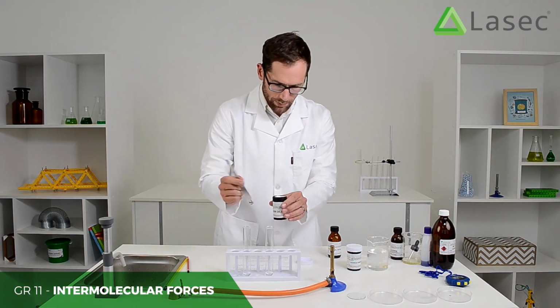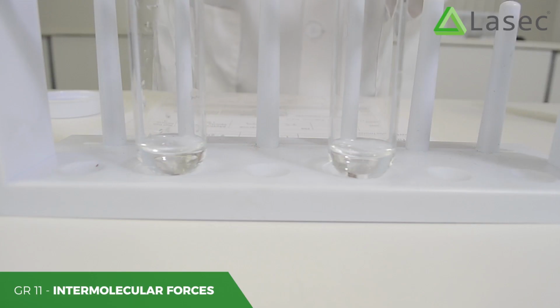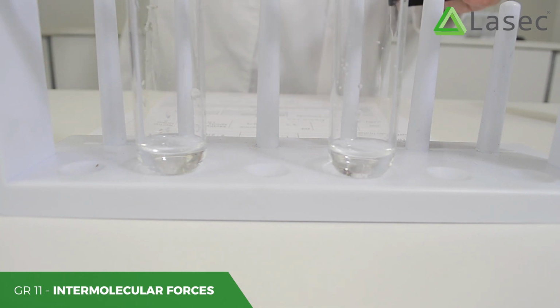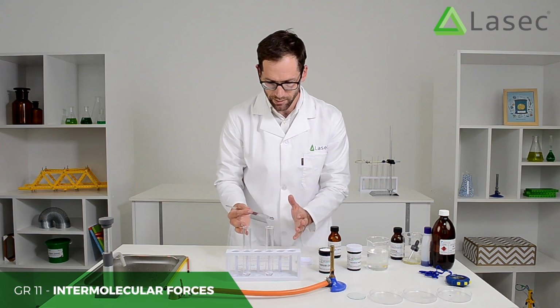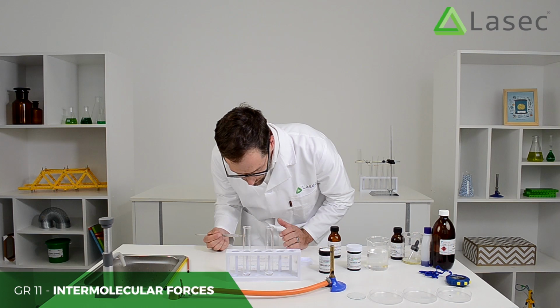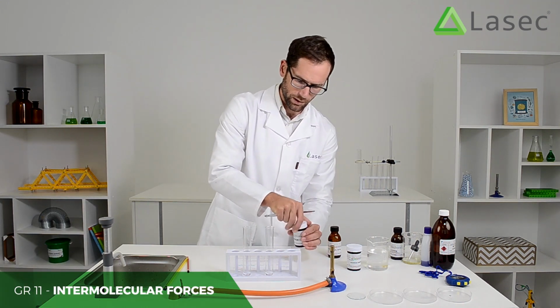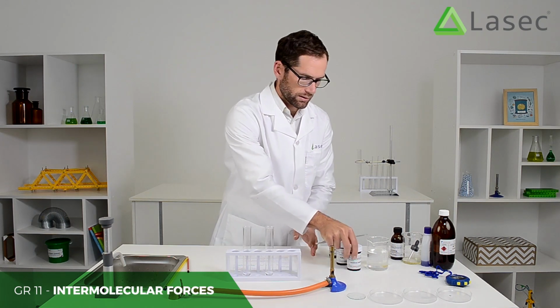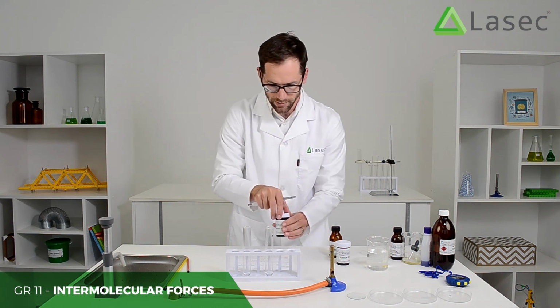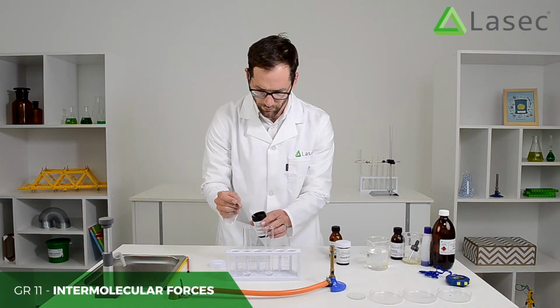I'm just going to take the tip there, and I'm going to drop that in, and we're going to check. What we can do is we can time that, check how long it takes, and while that is going, and I'm looking at the properties of it, I can still see the little crystals. I'm going to take some potassium permanganate. So the learners would need to time this, and they'd also need to observe what happens.